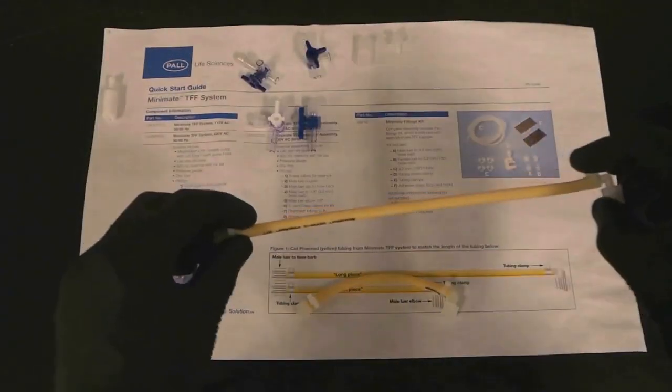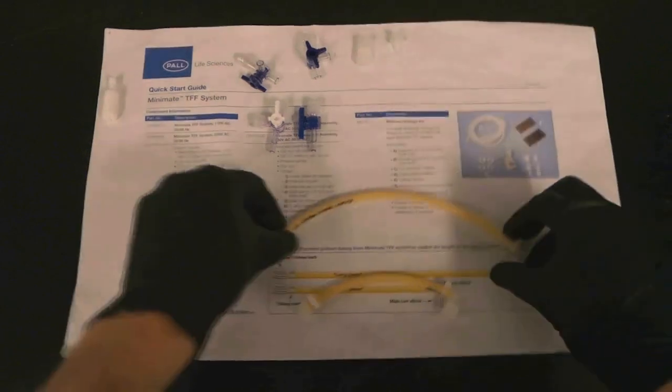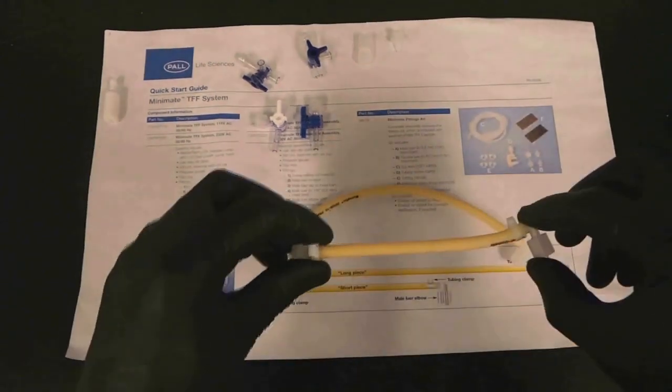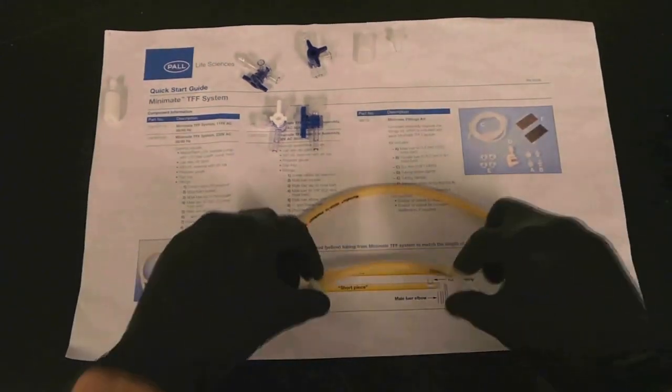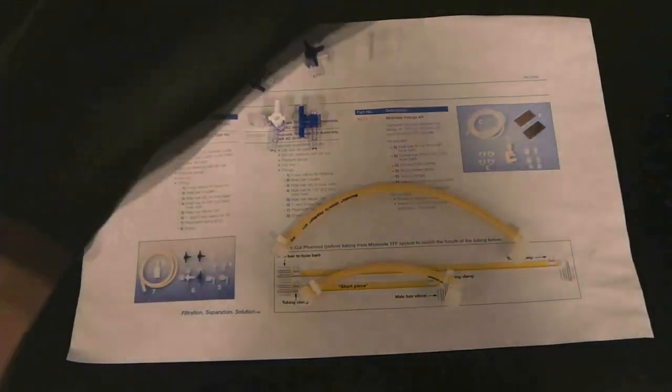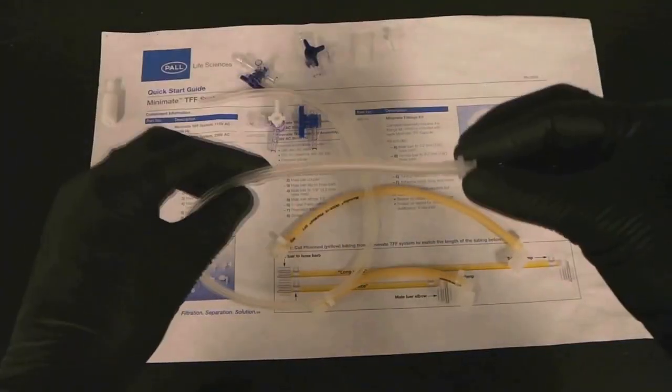The long tubing will go from the reservoir through the pump head to the pressure gauge. The shorter tubing will go from the MiniMate cassette back to the reservoir, and a clear piece of tubing will go to a vessel to collect the permeate.